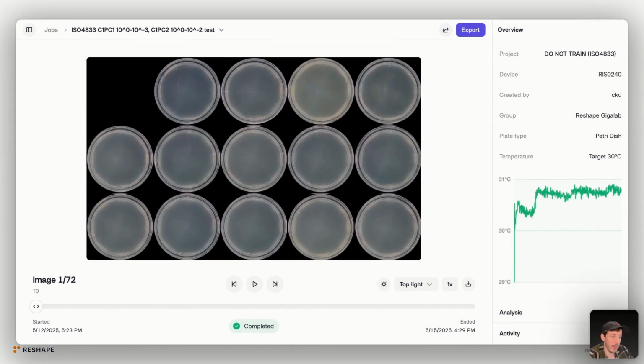In this video, I'm going to show you how to review a job. All I'm showing you today applies for jobs that are still running and for finished jobs, of course. All right, in the previous video, I've shown you how to find a job, so I'm starting off on this screen here, which opens up once I click on the job that I'm interested in.